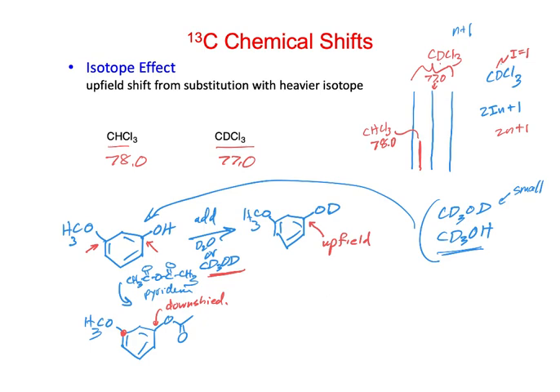Questions? Yeah. Why would the chloroform have two peaks instead of one? Because 2n plus 1 would still be 2, or 1/2 times 2 plus 1. Yeah, let's think. It seems right, but there's a reason here. You're just forgetting something from last time. It's decoupled. Yeah, it is proton decoupled. Exactly. Very good. That makes sense. But it's not deuterium decoupled. Right. Yeah, exactly right.